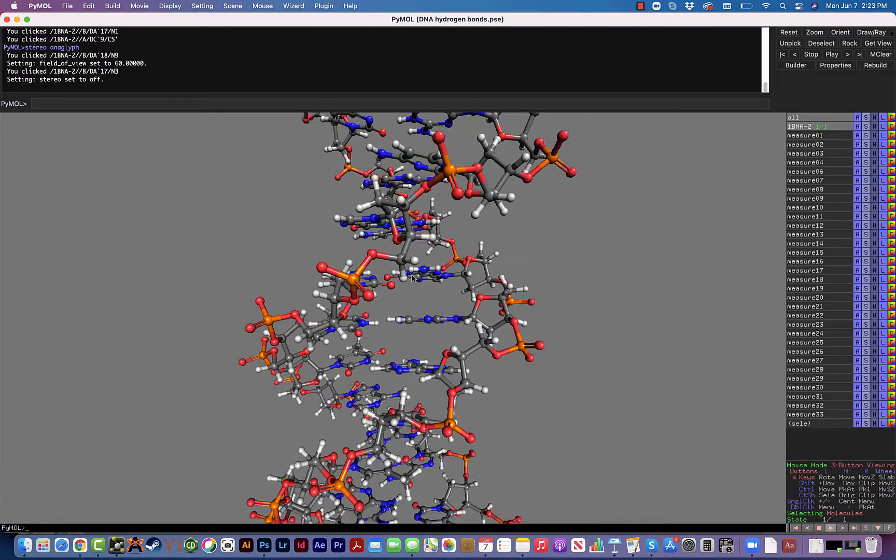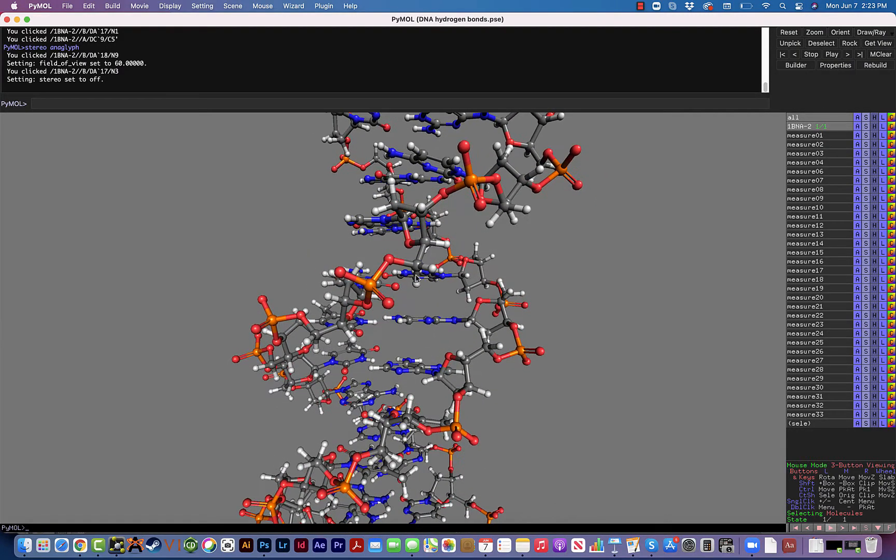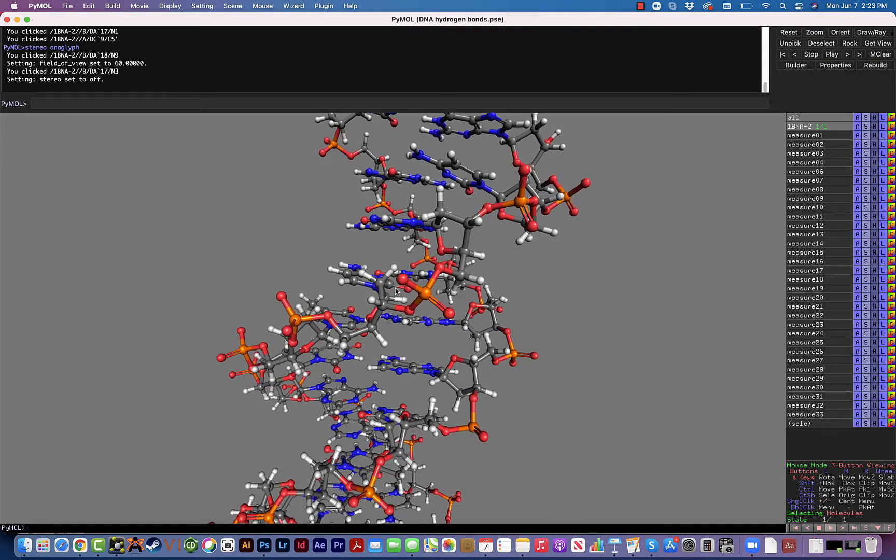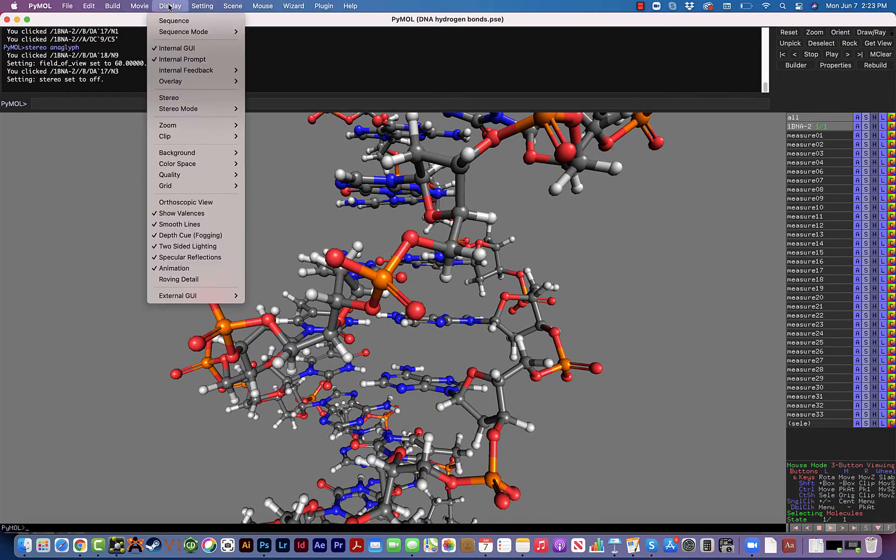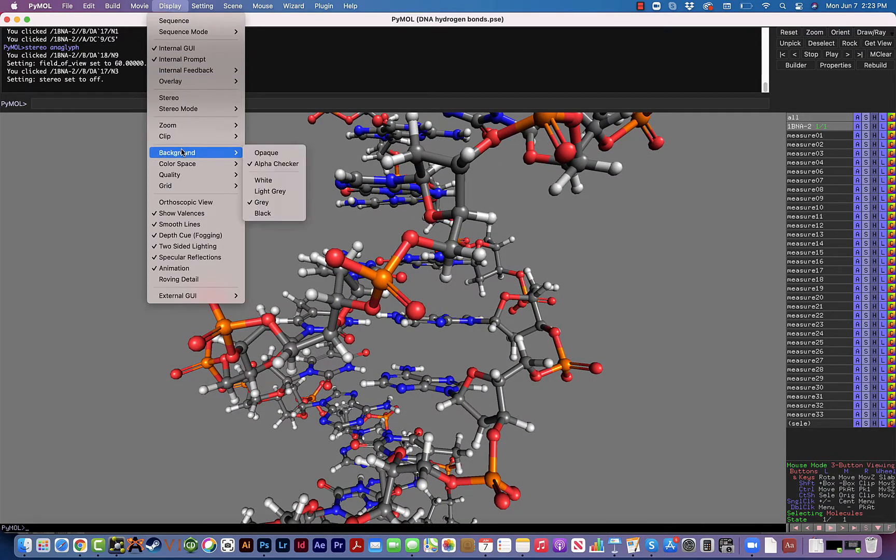The one other thing that you might have noticed is I'm using a gray background. I noticed that changing the background from black to gray is a little bit nicer.